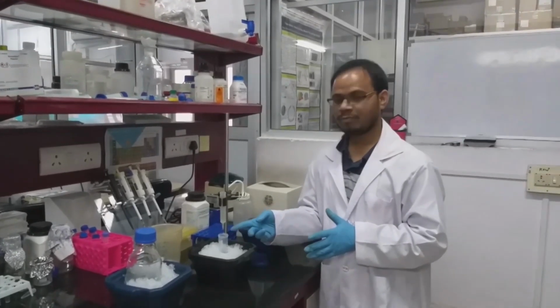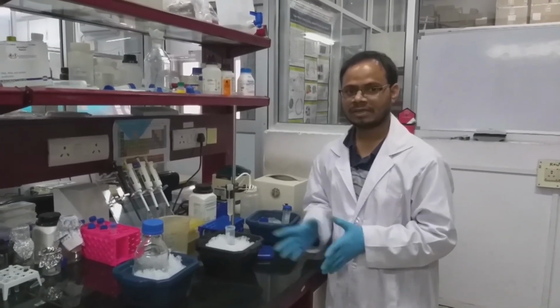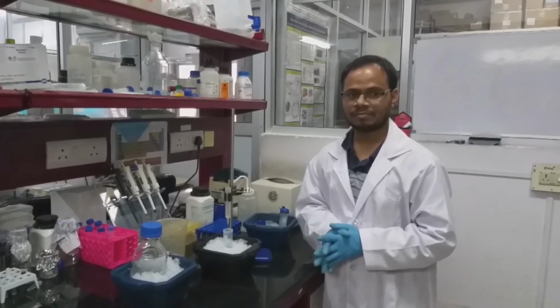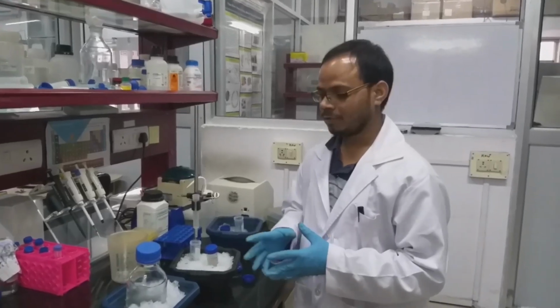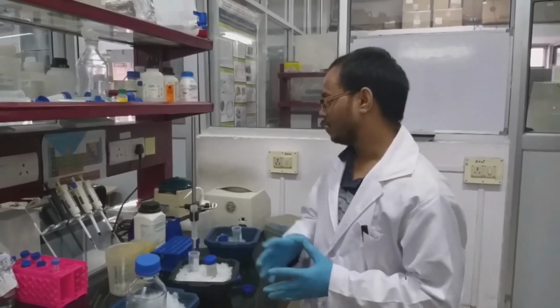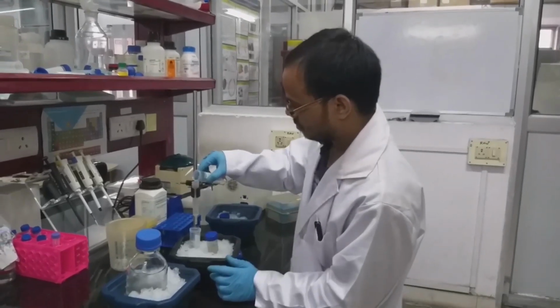This is the flow through. Whatever we are getting is flow through. In the next step we will wash with the lysis buffer. In this step we are going to wash with the lysis buffer or equilibration buffer. So this is the lysis buffer.